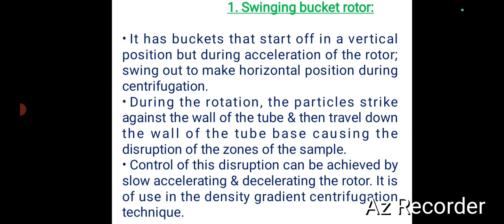This can be rectified. Control of this disruption can be achieved by slowly accelerating and slowly decelerating it. It is of use in the density gradient centrifugation technique. The swinging bucket rotors are especially used in the density gradient centrifugation technique.